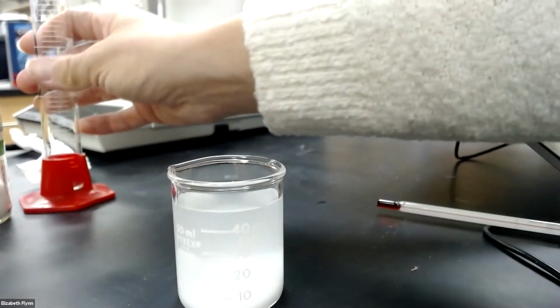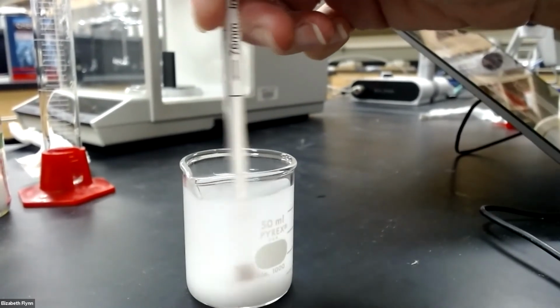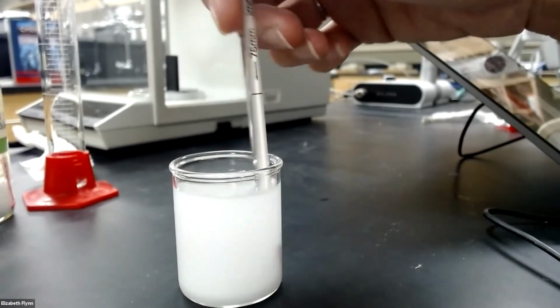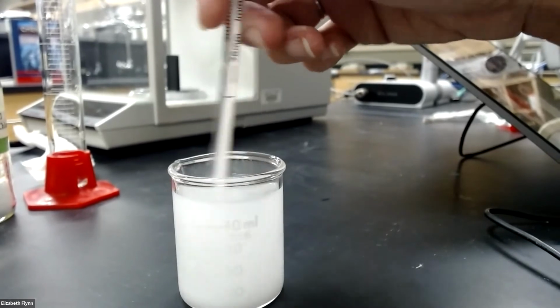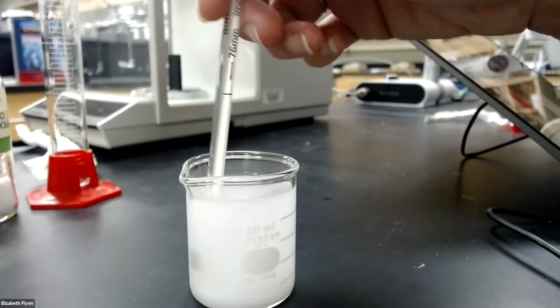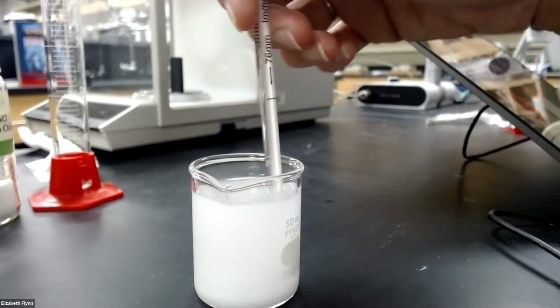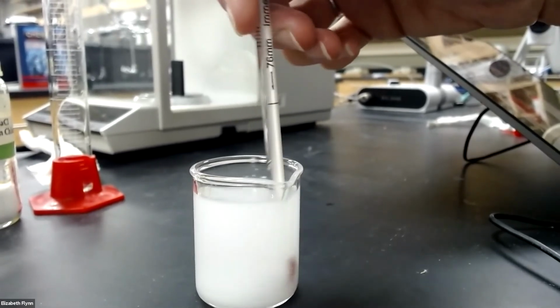All right. And likely you'll need some heat to help dissolve. Okay, so you can use your thermometer, just be really gentle with it. Please be careful because this glassware, it'll just be a hassle for you if anything breaks. If you're on a hard surface, like a tile floor or a tile tabletop, I recommend laying out a towel on your workspace so that there's a soft landing if anything should drop.